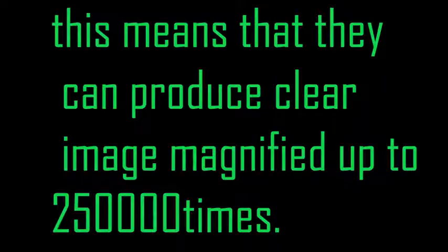This means they can produce a clear image magnified up to 250,000 times. Now, the final image produced is a two-dimensional image.